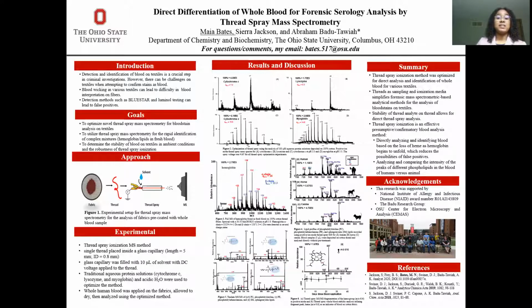An ambient ionization method could be used instead, using a thread-based substrate, which is shown in Figure 1. Investigators could take a fiber from blood-stained carpet, or even a thread from a t-shirt, and with no preparation, just solvent and voltage, they can get results immediately.